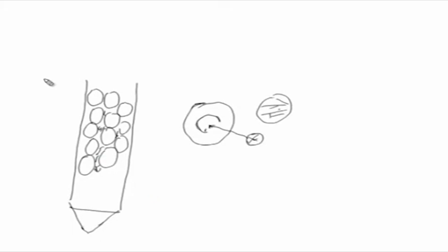So, this will come very fast, but the smaller molecule will spend more time because it will go back and forth as it travels down the column, moving between the stationary phase and the mobile phase. If you compare different sizes of molecules, one size, another size, a larger size, then all of these molecules, according to their molecular mass or molecular weight, will spend relatively different times: the smaller the longest time, the largest the least time, and in between they will spend different times as per their size.